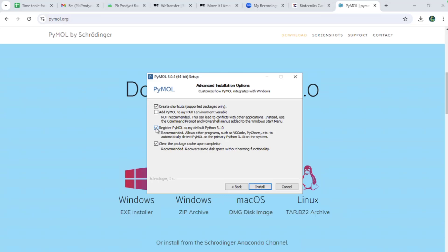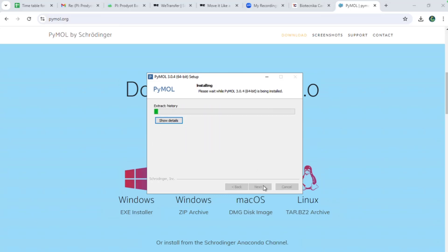You can also register PyMOL with a default Python, so if you're using an IDE like VS Code, PyCharm, Jupyter Notebook, or Spyder, you can open PyMOL from there as well. Click that option if needed, then hit the Install button. It will first set up the package, then set up the environment.